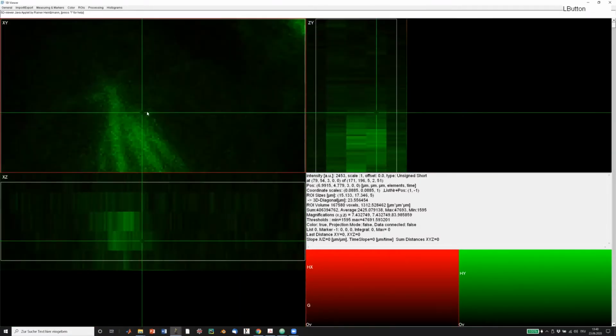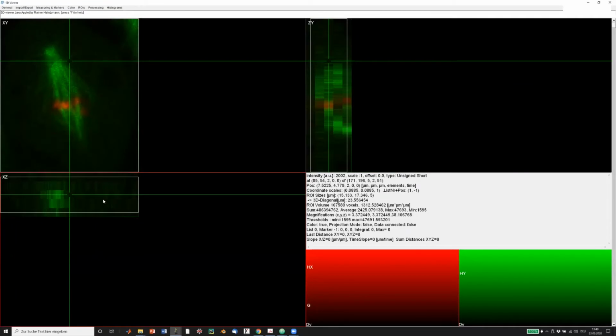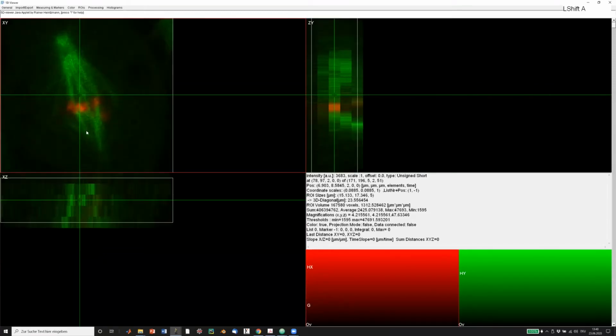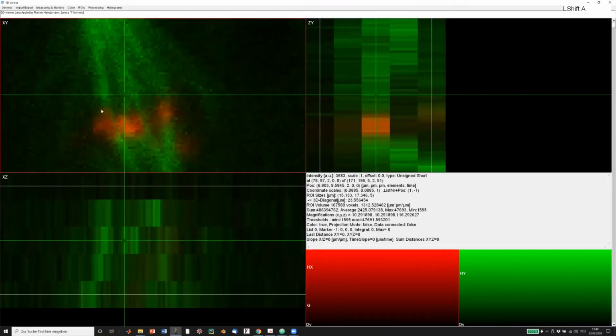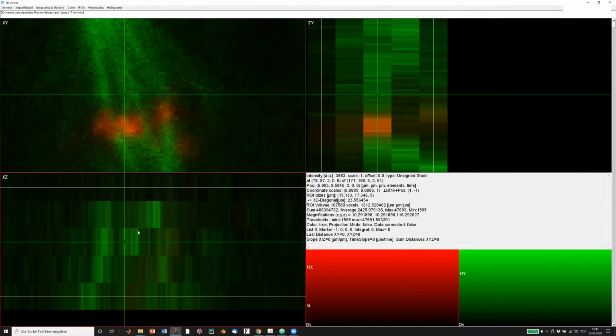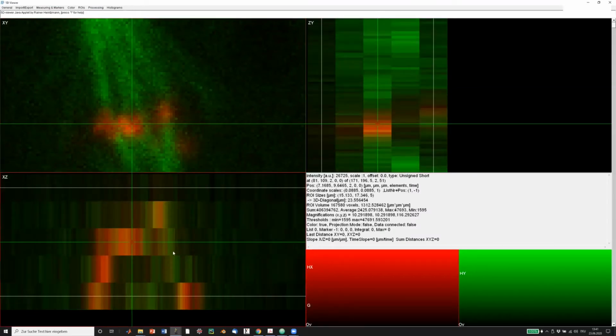If you're lost, you can press I. Actually, if you go into one of these views, pressing I gets you here. So what you might have noticed is that whenever I zoom into XY, then also the Z location updates. So this ensures that we have the correct sort of physical scaling of the pixels in X, Y, and Z.